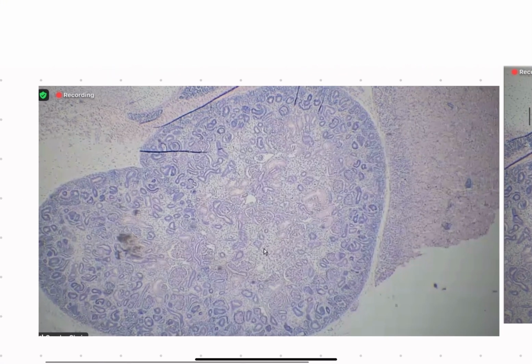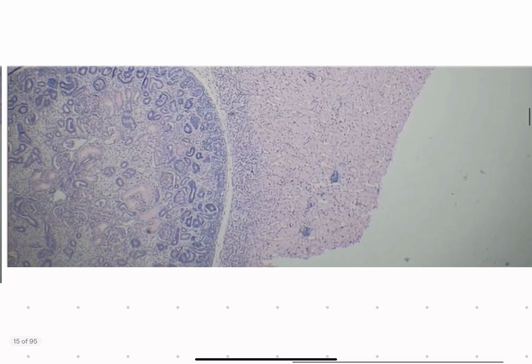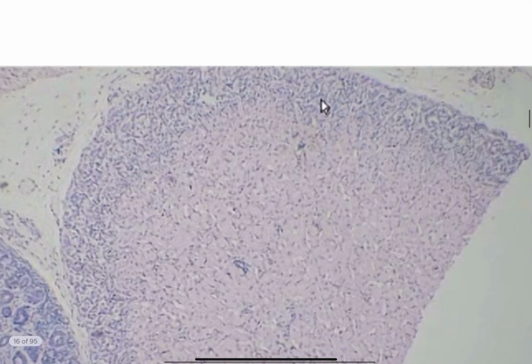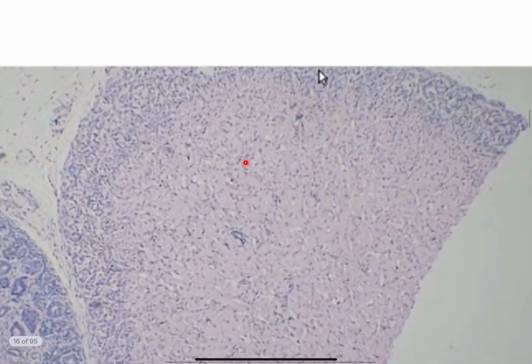Next up, we have these slides. Now these slides are separate. They're not involved in a larger slide. I think that's fair to say since we can't really move around given that these are images. Then we go towards the right and we zoom into this. And we see this. Please write down the name of this structure.